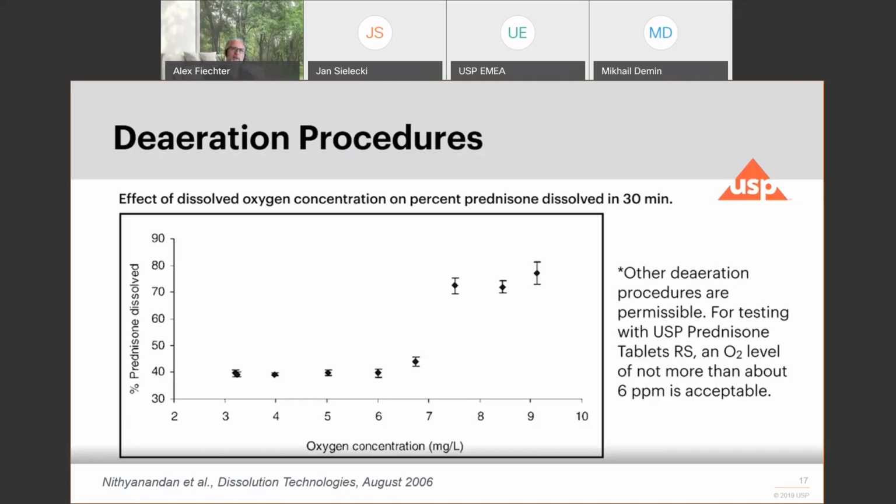When you look at this chart, the left-hand side percent dissolved and oxygen concentration to the right will result in the normal, after 30 minutes released concentration of your sample prednisone.